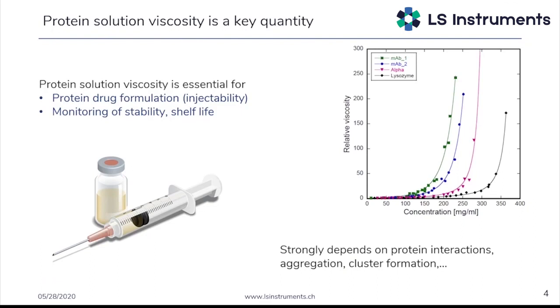It's a great pleasure for me to give you a short introduction to protein microviscometry using dynamic light scattering. Now, protein solution viscosity is actually a key quantity.